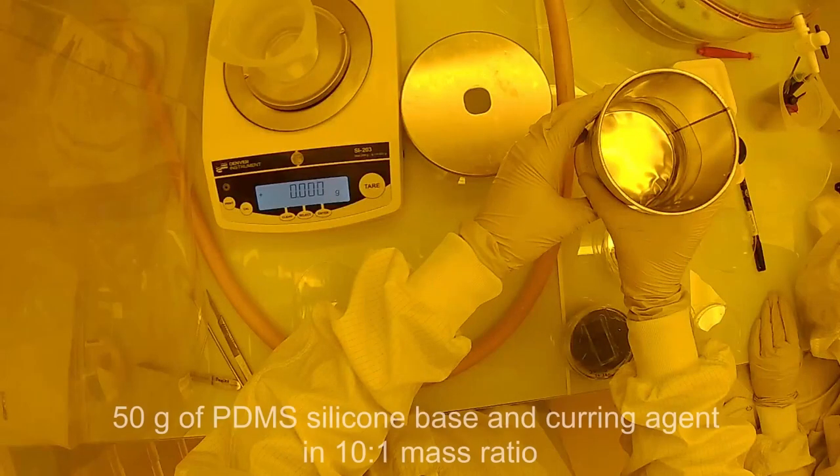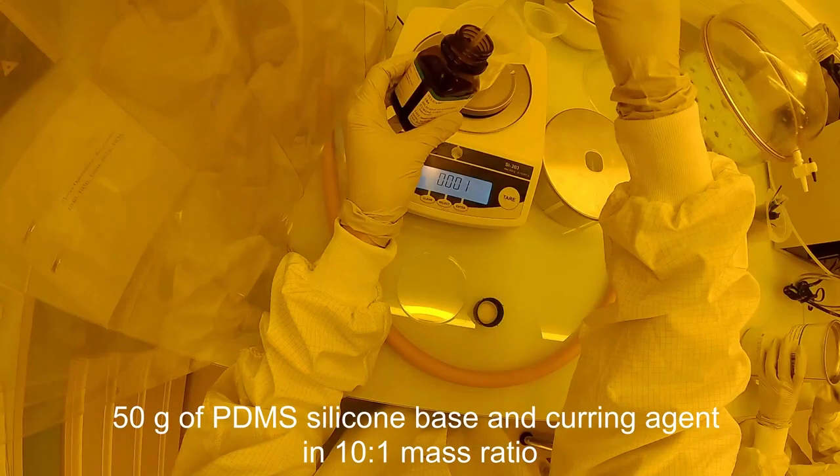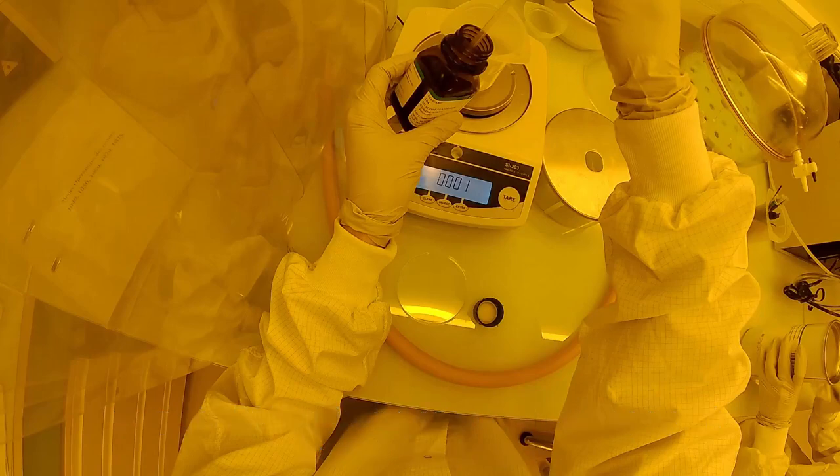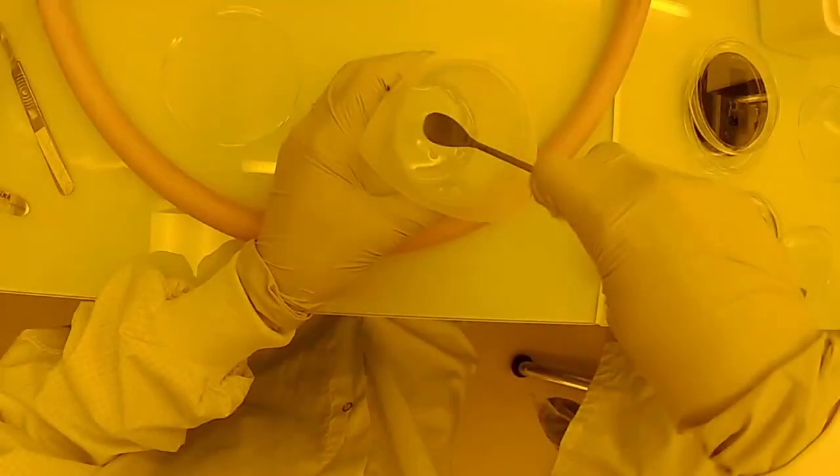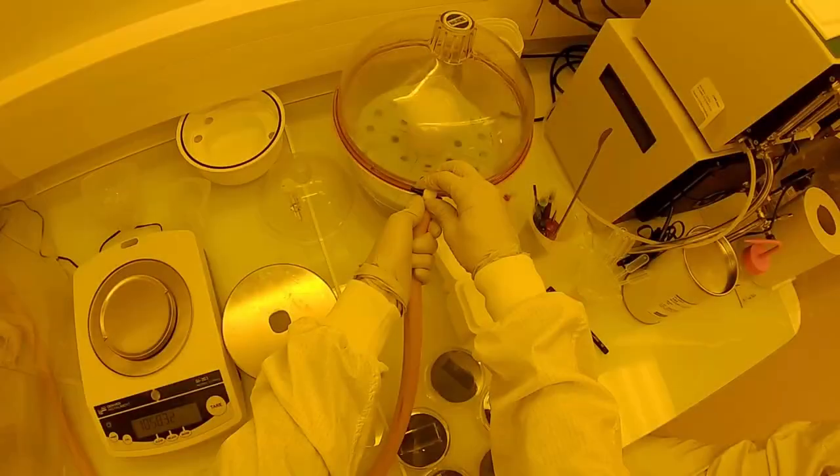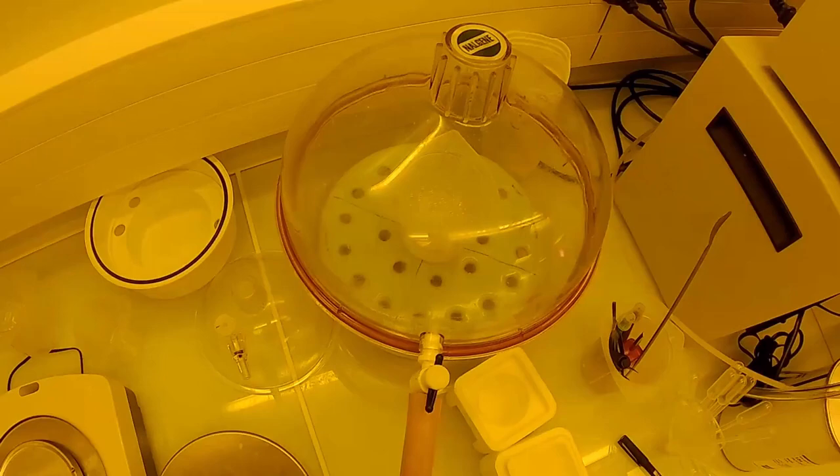First, prepare 50 grams of PDMS silicon base and its curing agent in a 10 to 1 mass ratio. Mix the two ingredients in a beaker with a spatula. After mixing, place the mixture in a vacuum chamber in order to remove all the air bubbles.